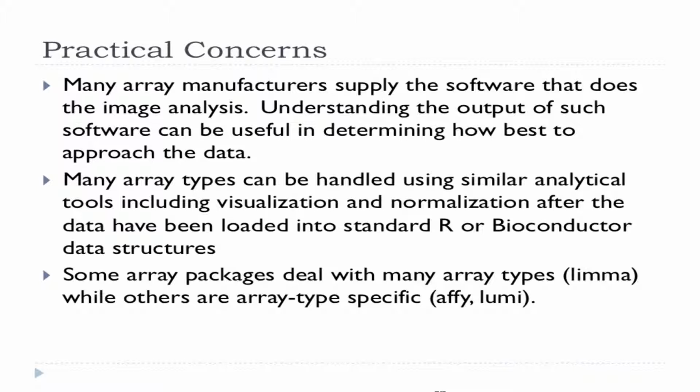Many array types can be handled using similar analytical tools. So if you get a new array type and you don't have somebody who's seen it before, you don't have tools that have been developed before, try the ones that you already know. And they'll often work. And some array packages deal with many types of arrays. The Limma package, for example, which you guys will be using this afternoon, can deal with lots of different types of arrays. But it does it in a very general way. There are other array type specific platforms, the Affy package that you'll be using for my lab, and the Lumi package for dealing with Illumina arrays that sometimes offer additional features that are specific to those array platforms.